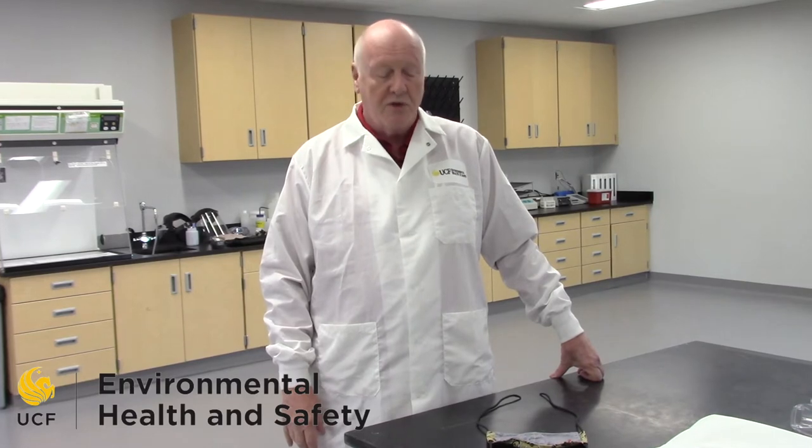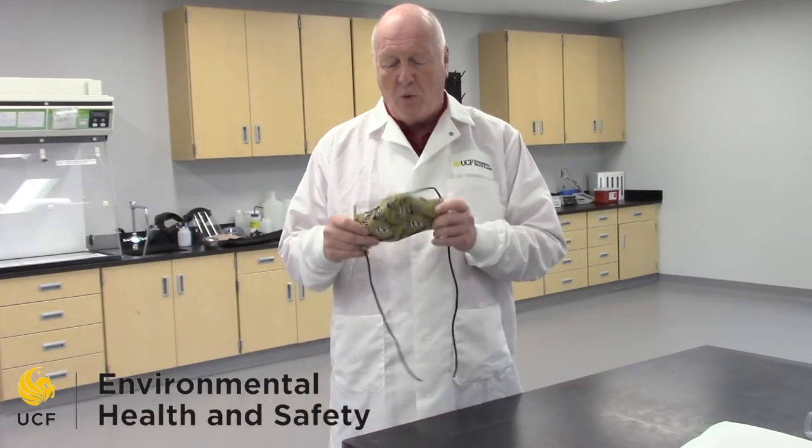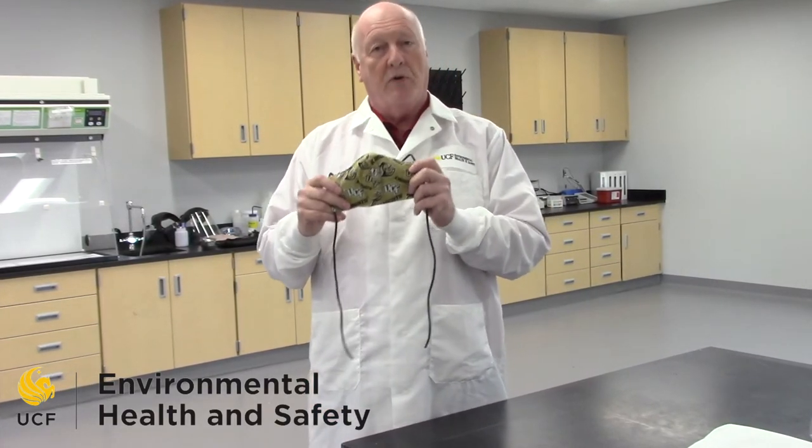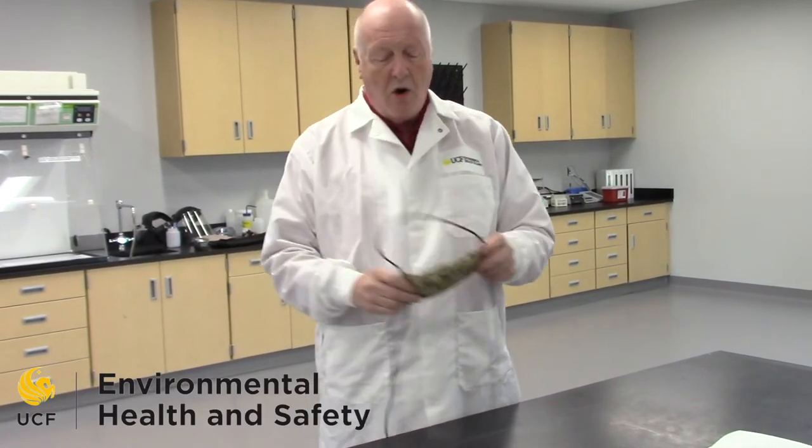Hello, I'm Don Sibley. I'm with Environmental Health and Safety. I'm also the biosafety officer for the University of Central Florida, and we're going to discuss the new requirement for face coverings. These cloth face coverings, like this one that's got the UCF logo on it, are going to be required for all personnel coming onto campus during the first phase of the restart.